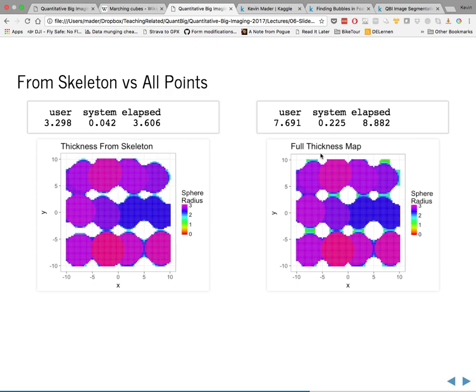Because even with this map, at your edges or borders, particularly if they're very edge-shaped, you're going to find regions which don't fit into any sphere particularly well, or single pixels which don't fit into a sphere particularly well. And what you have to have is some sort of model for whether this single point on a border is actually relevant for what I'm doing, or is it not?